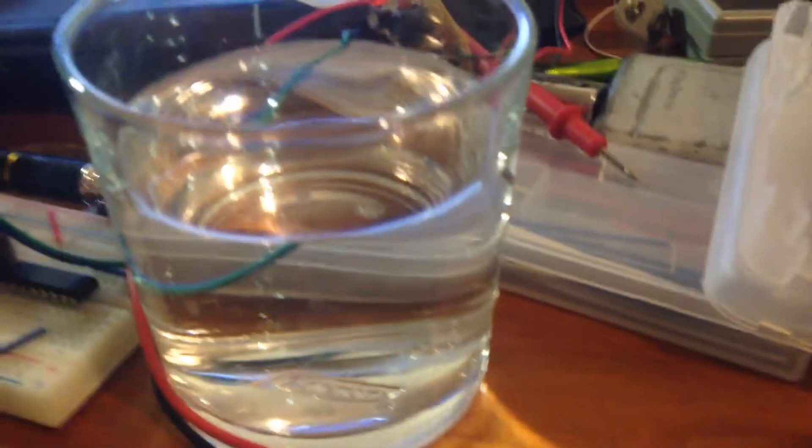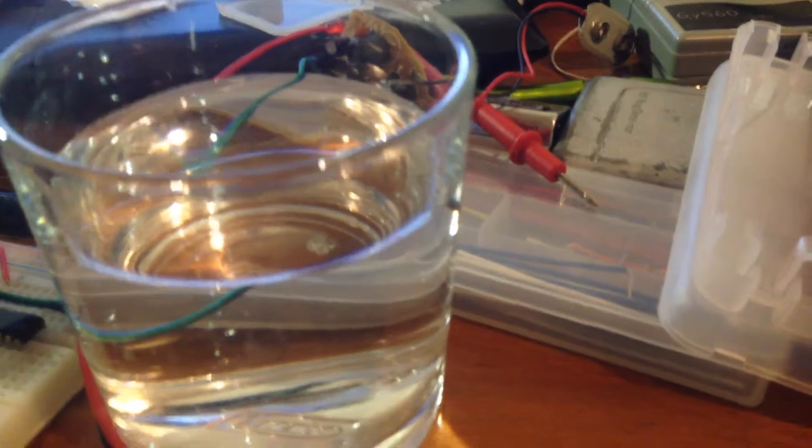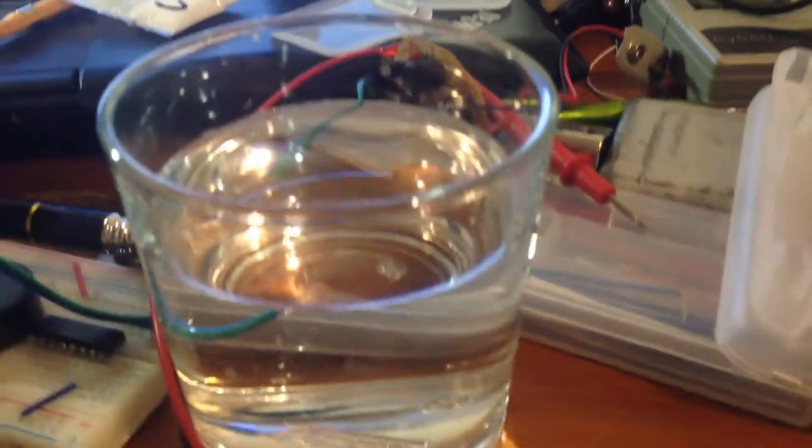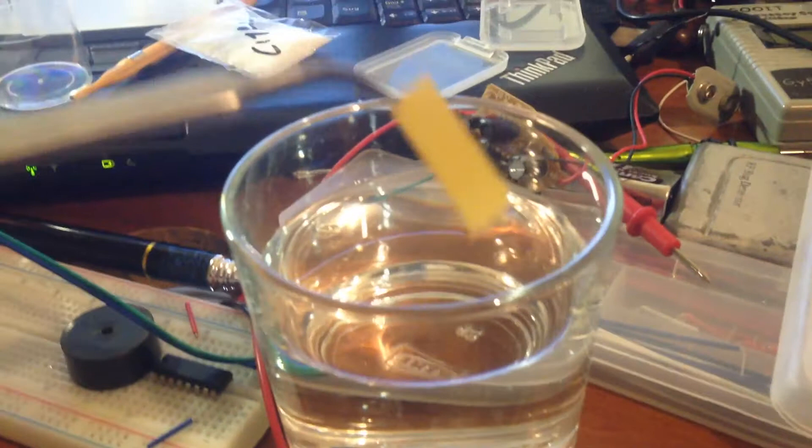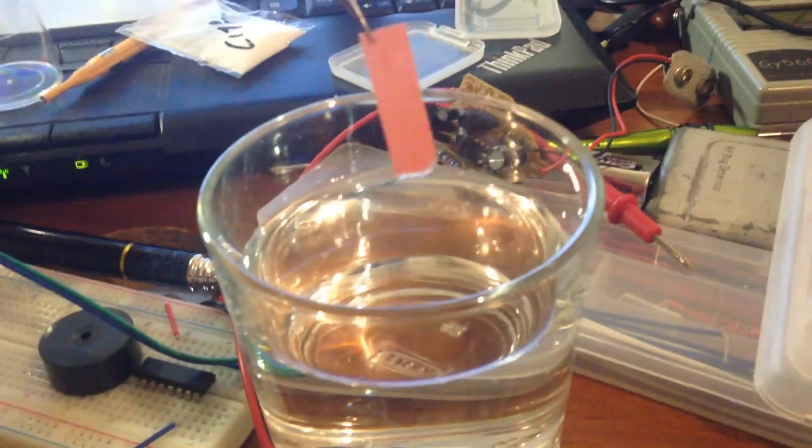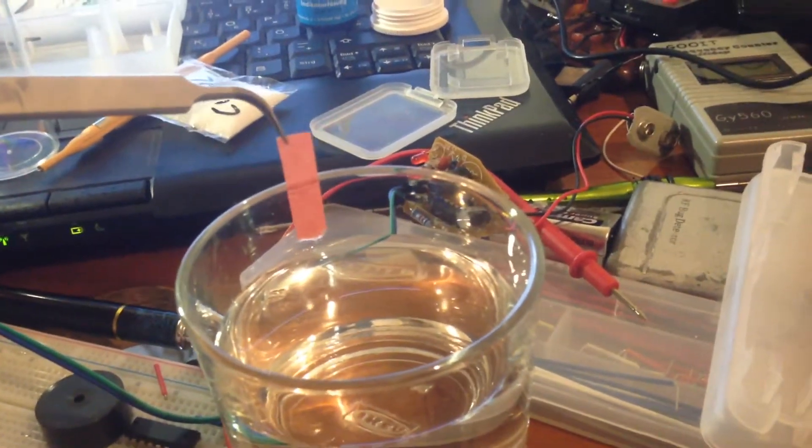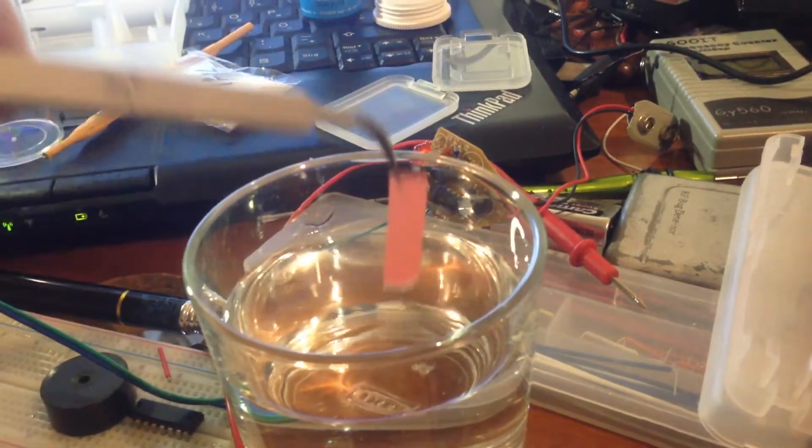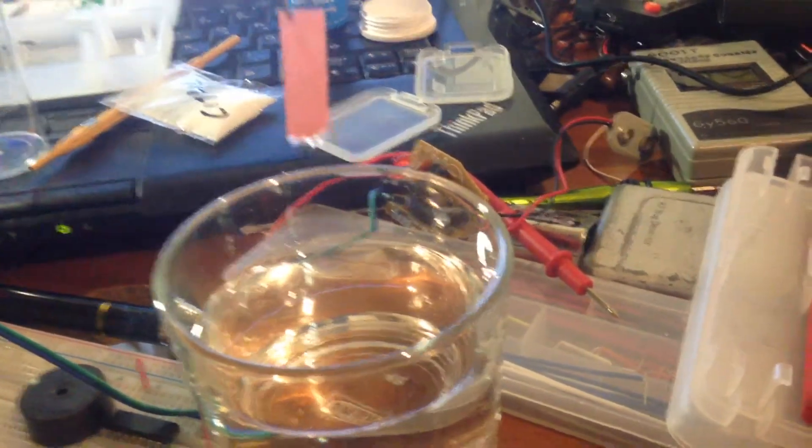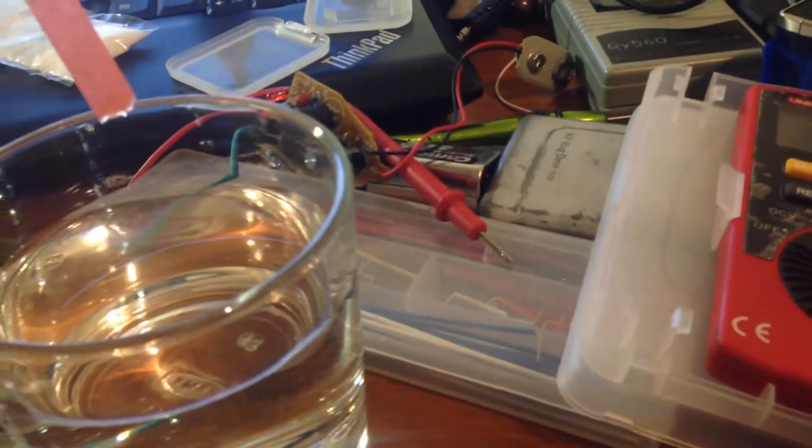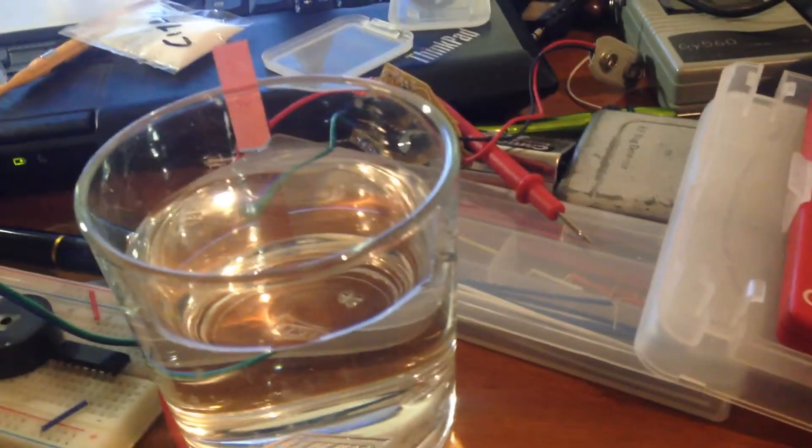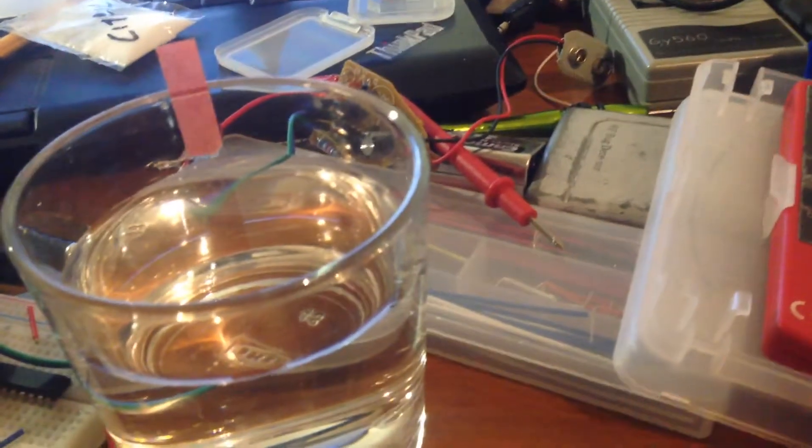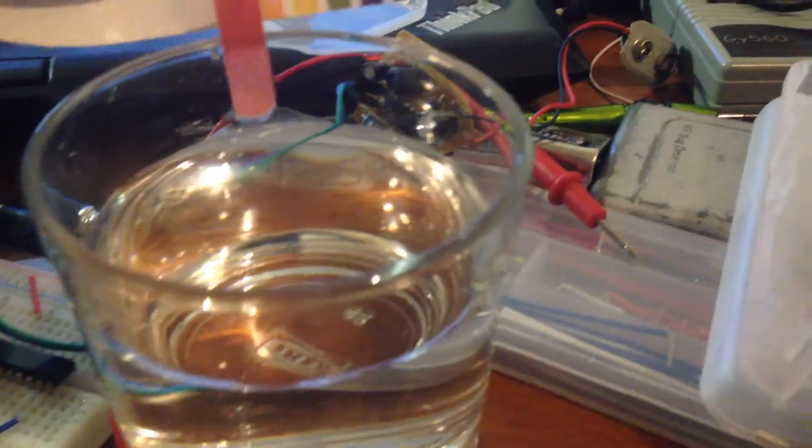the brand name is pH 180C from Voltcraft, I will try the paper pH test to test this citric acid. You can see exactly as soon as the pH paper goes in, exactly the color is going to pink and it's something like two.